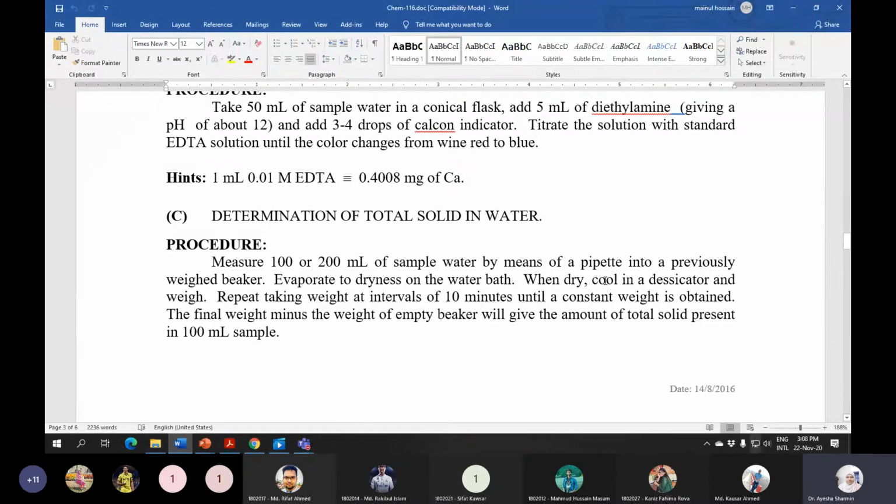beaker, you clean the outside of the beaker so that no water is left over, and then let it dry inside a desiccator. A desiccator is a kind of glass apparatus, where we have some chemicals like sodium sulfate or silica gel, which can absorb any remaining moisture in the air. Okay, you have seen in some electronic devices when you purchase them, inside there are small silica bags. Have you noticed that? Or with some medication also sometimes those things are present.